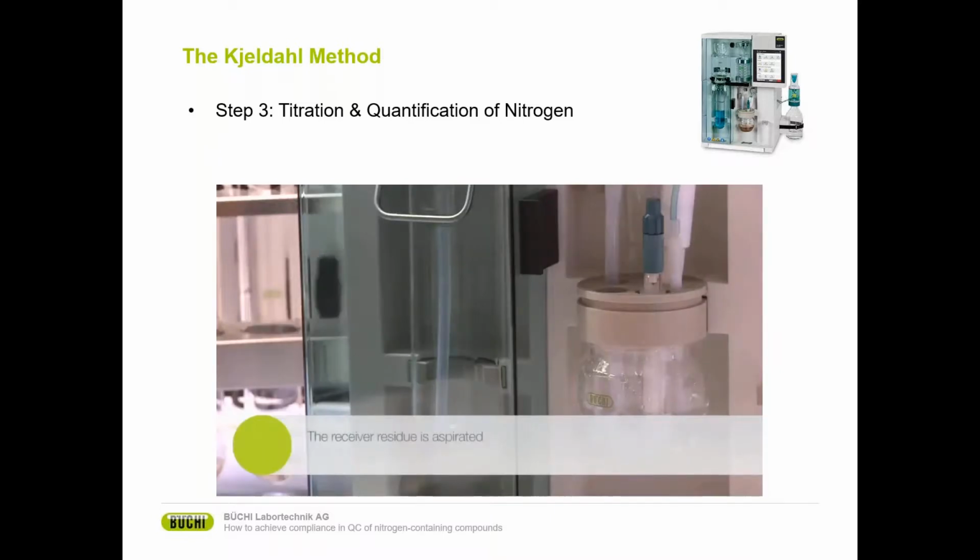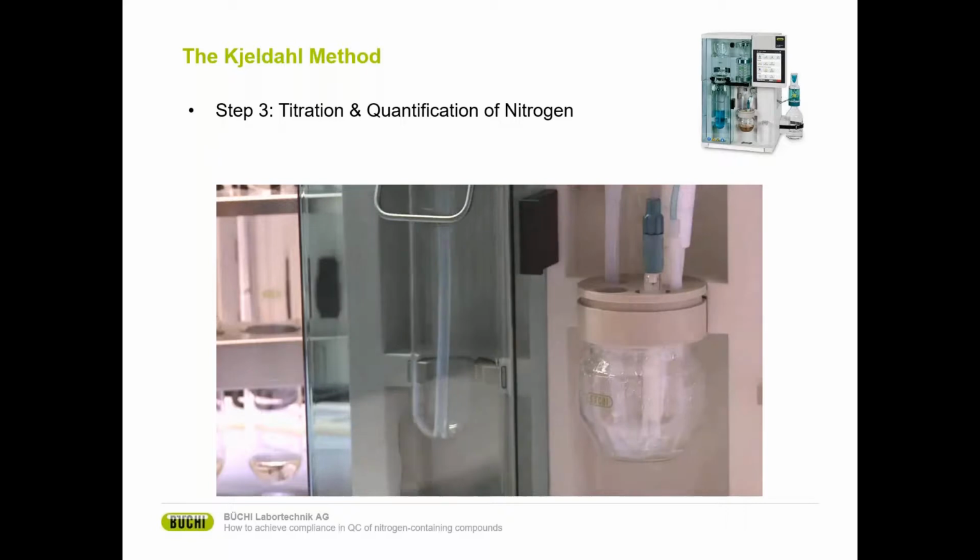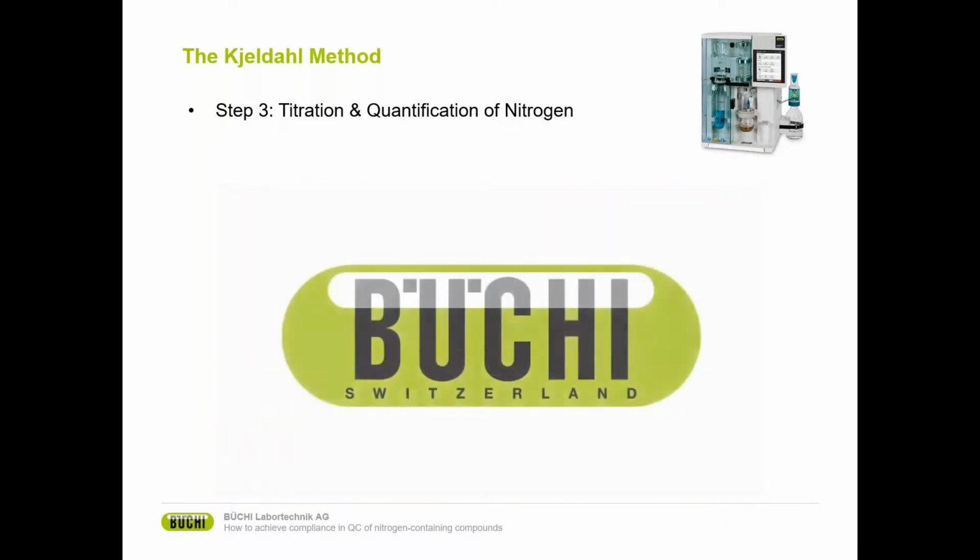And this is being done automatically. And afterwards, the receiving vessel is being aspirated and cleaned, so you can start with the next run already.